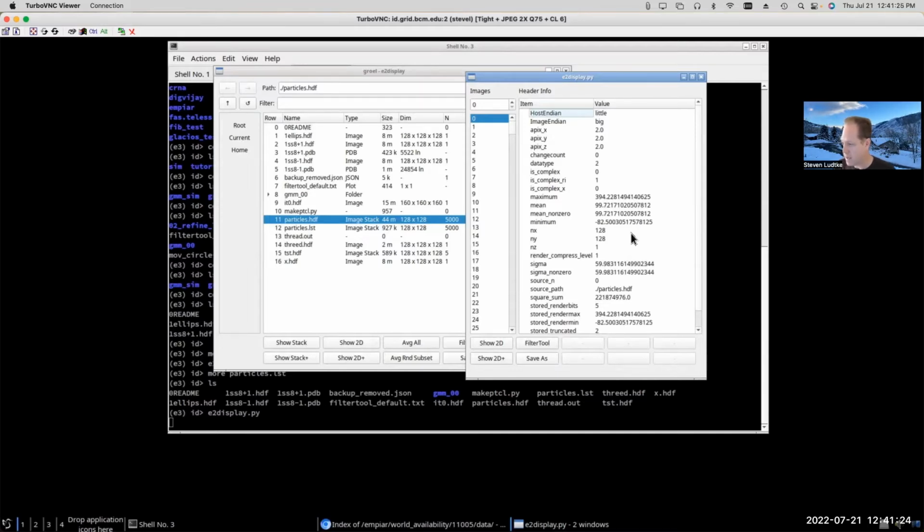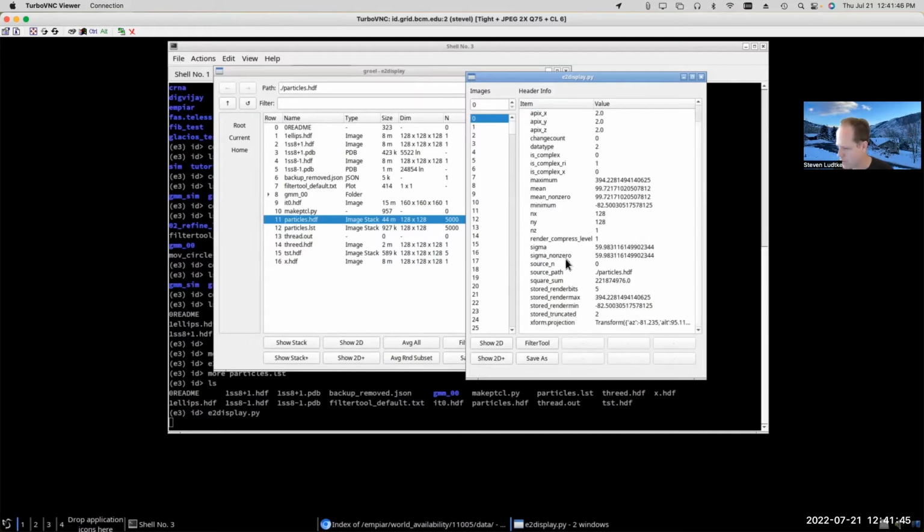And if we wanted to run a refinement and then we wanted to run another refinement, we'd have to make a copy of all of the data in addition to the metadata to alter those header values, because it's one header, you can only have one set of values. So the header is a great place to store fixed data that's never going to change, but the header isn't really a very good place to store data which you're going to be determining maybe multiple times and that sort of thing.